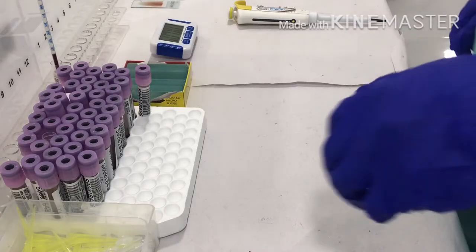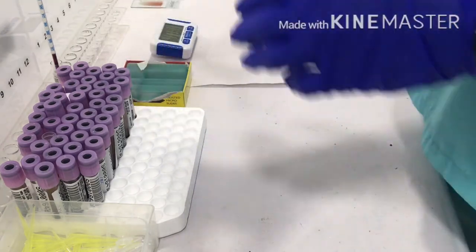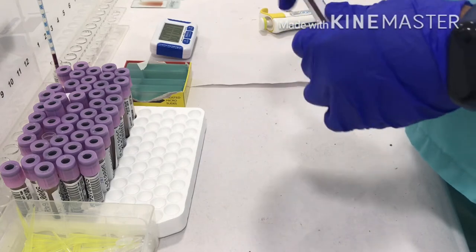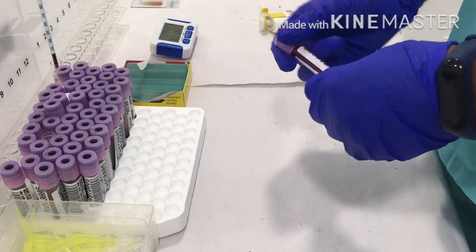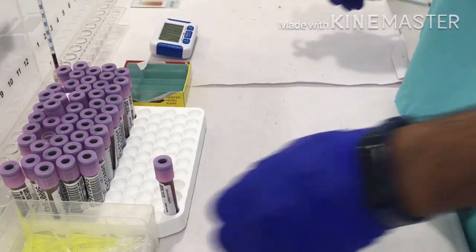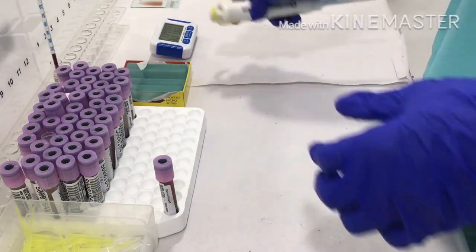So this Leishman stain is basically a Romanowski stain. Romanowski stain is nothing but a combination of a basic dye and an acid dye. So what happens here is the acid dye stains the cytoplasm of the cell, whereas the basic dye stains the nucleus of the cell. So that is the basic principle behind this.